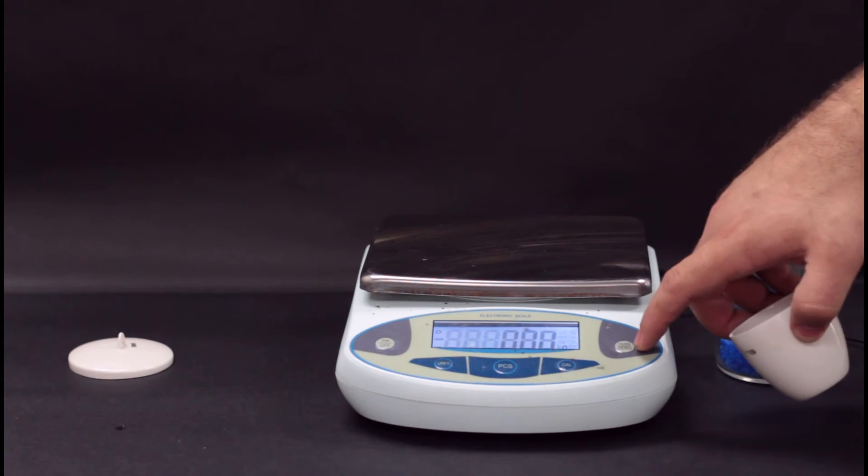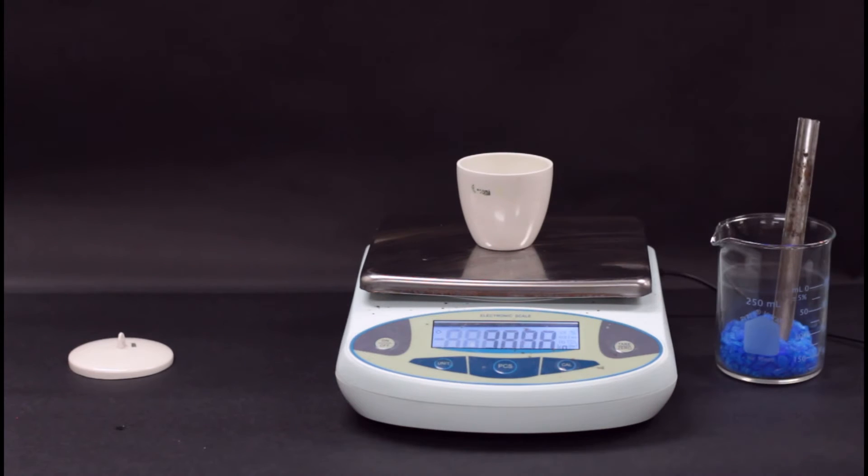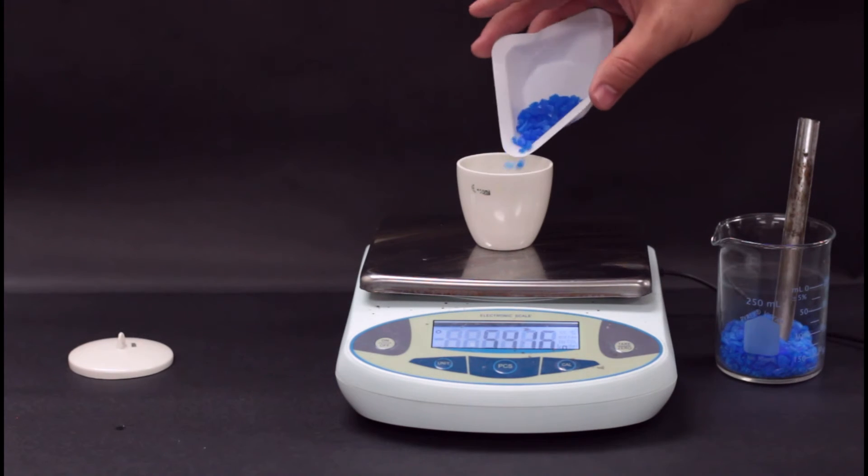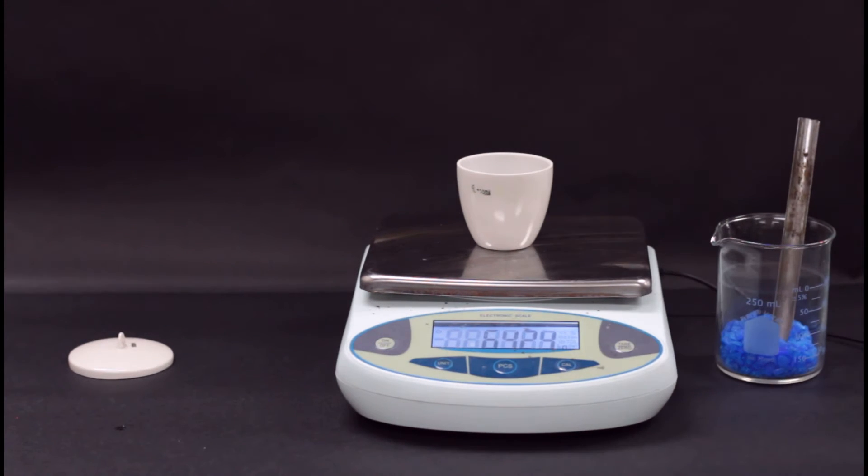Next, weigh your crucible and write it down. Then pour your copper sulfate and write down the weight of the crucible and the copper sulfate together.